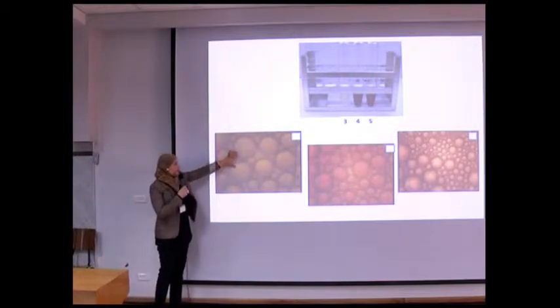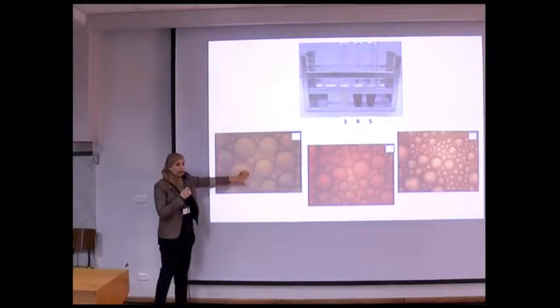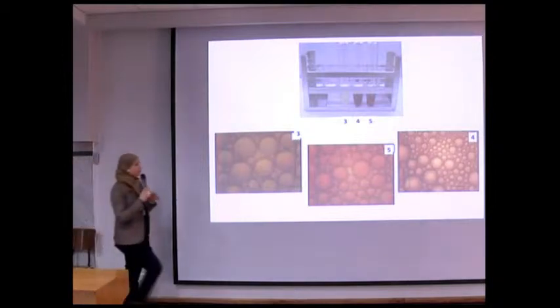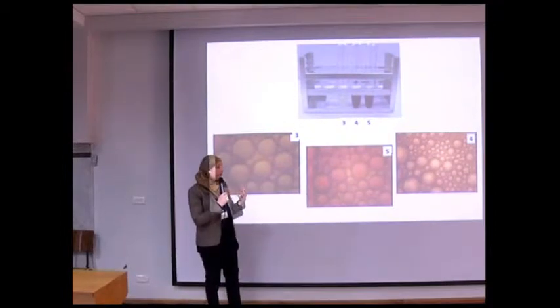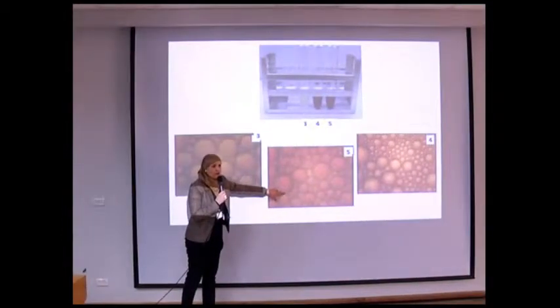In the case of the solution without the dye, we get spherical structures which are transparent, and the background is also transparent. But when we add the hydrophilic red color, you can see here that we have transparent circle structures and a colored background. In contrast, with the hydrophobic red color, we have colored spherical structures and a transparent background.